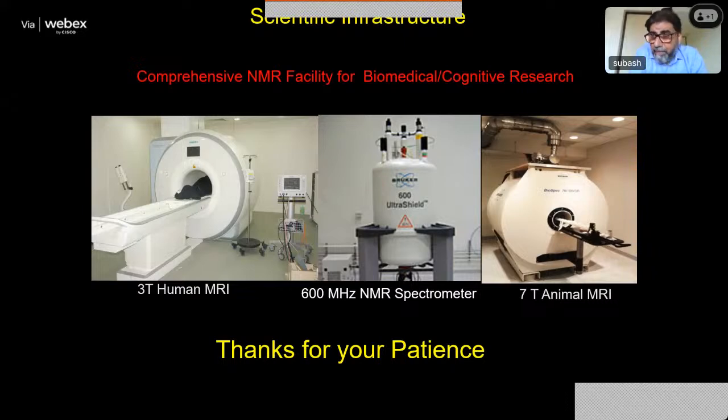So this is a very good machine for doing translational research for drug discovery and drug trial experiments on animals. In the center of the 2 imaging machines, we have an NMR spectrometer, which can be used for doing NMR spectroscopy of liquids and tissues, or in vitro samples, whatever you want to do.